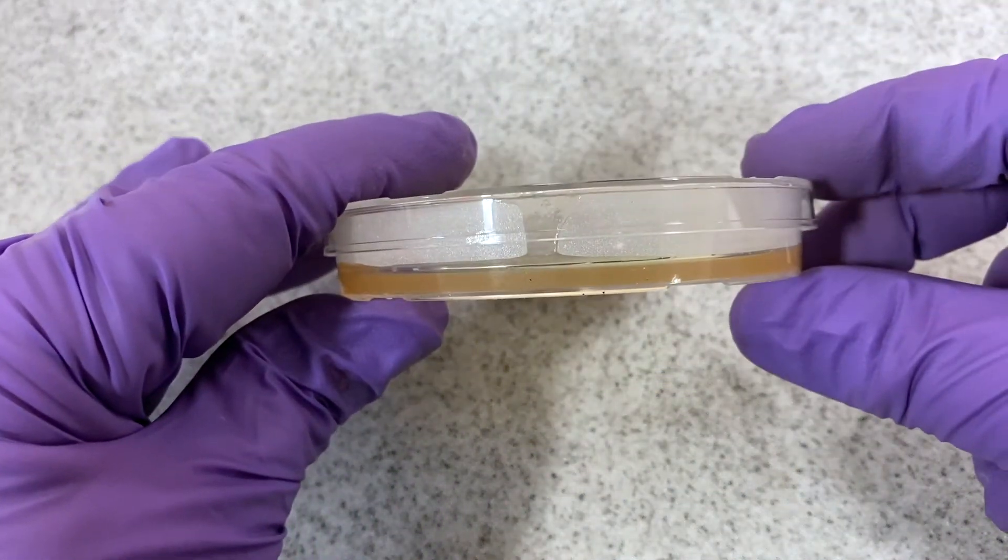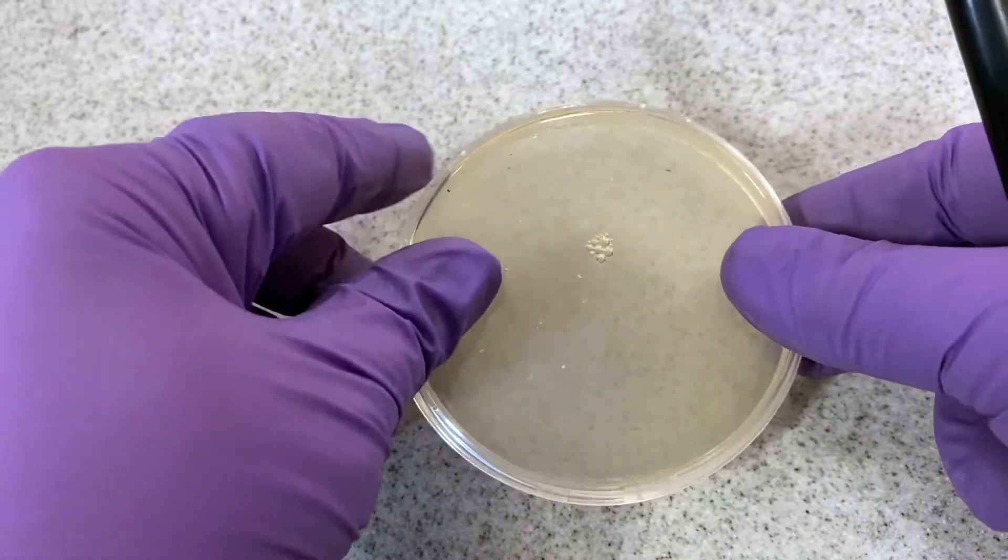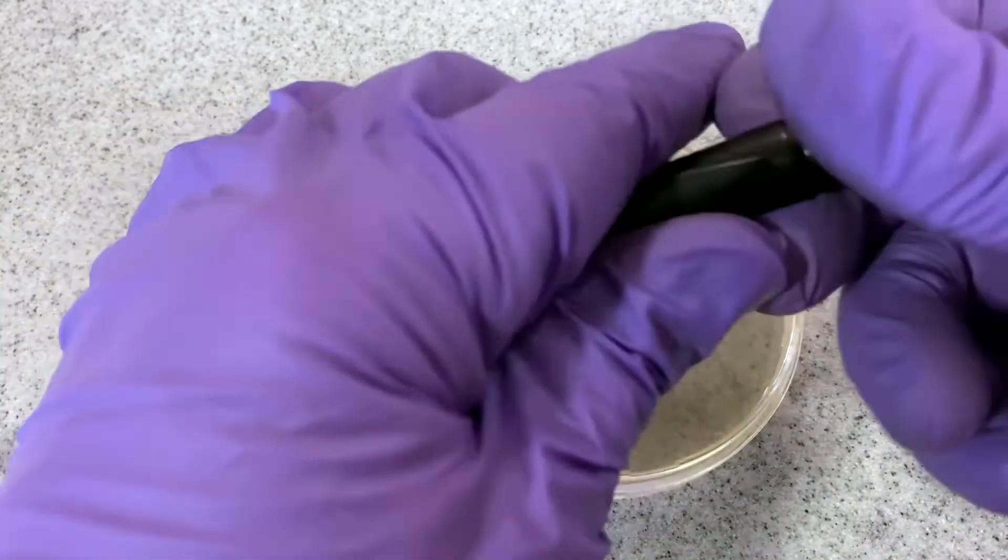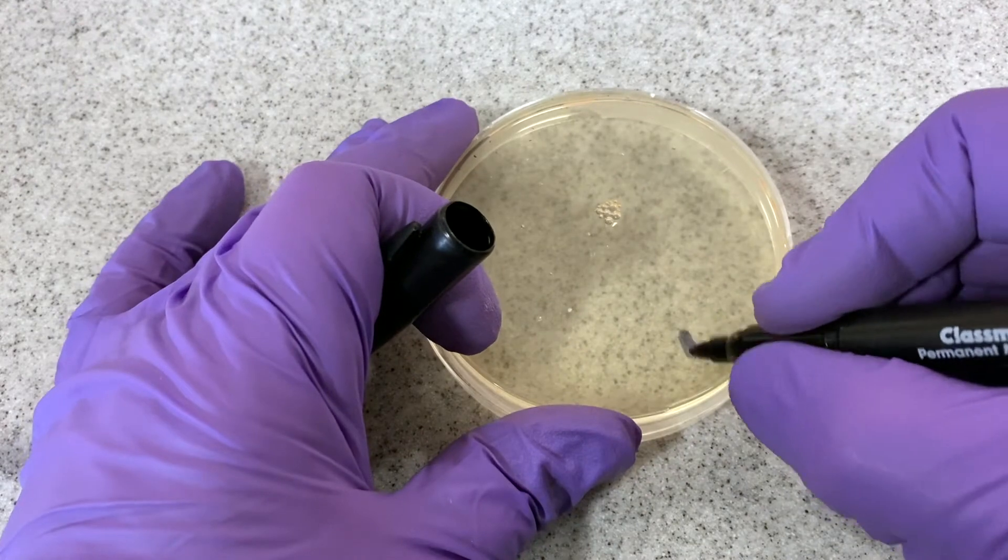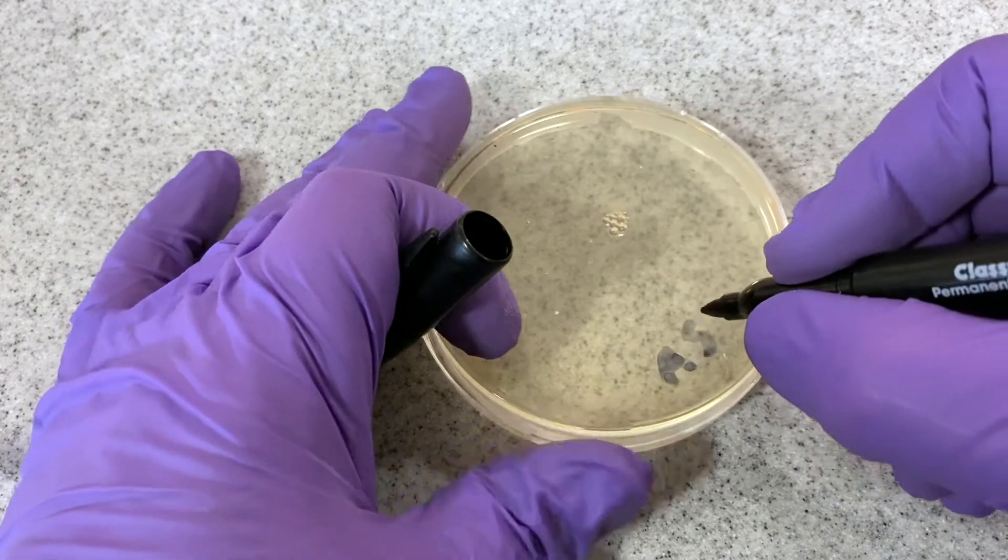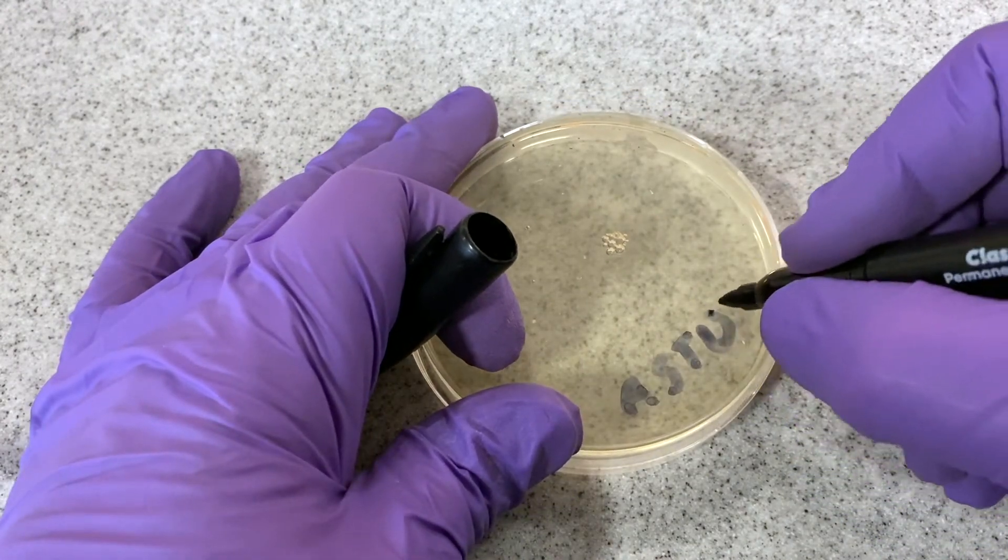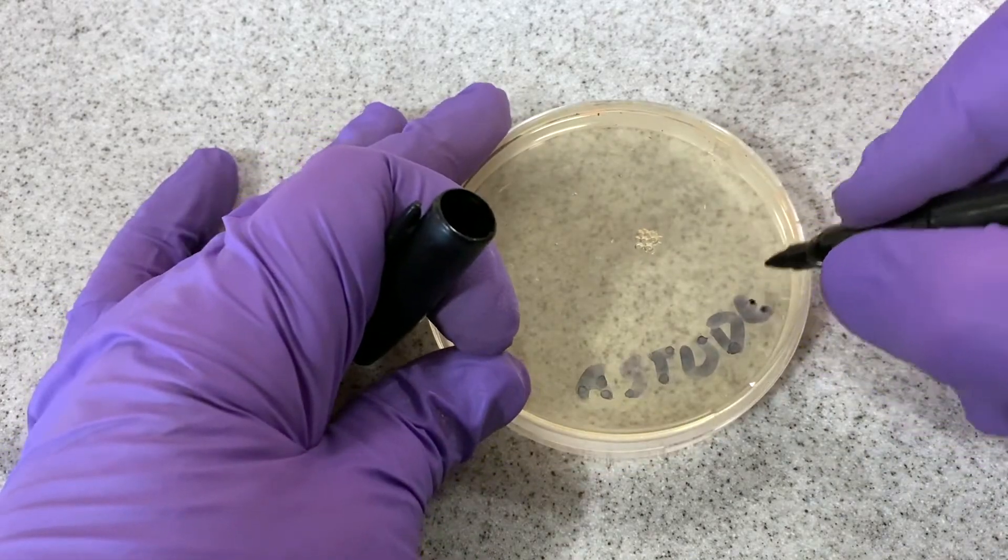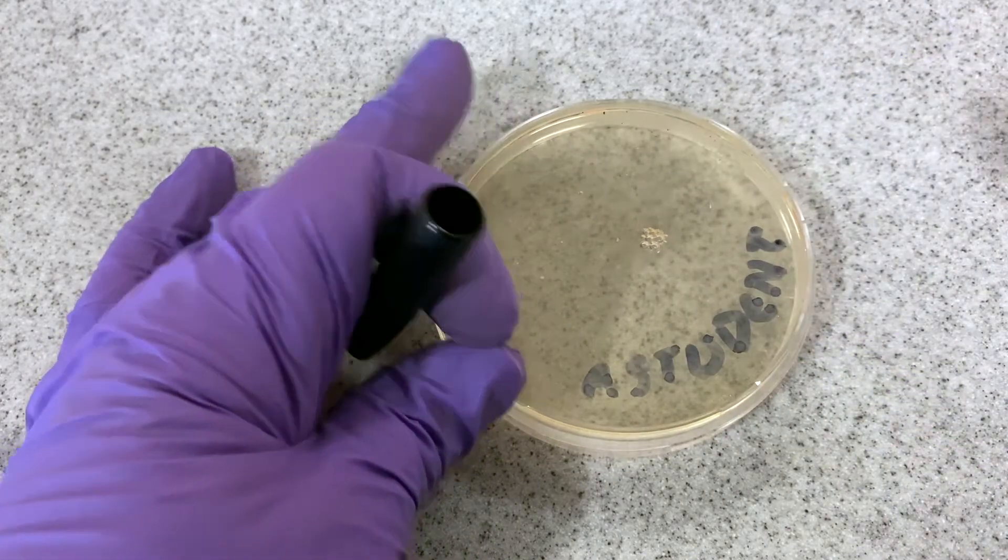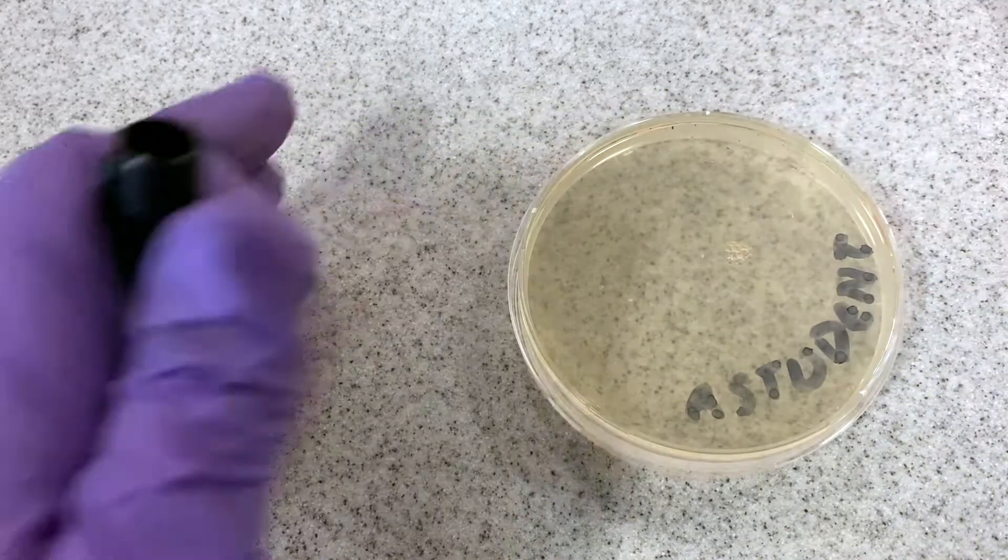On a cool laboratory bench, the agar medium takes around about 1 minute to solidify. Once it has become solid, the plate itself can be inverted and labeled. Always label the base of the petri dish containing the agar medium.